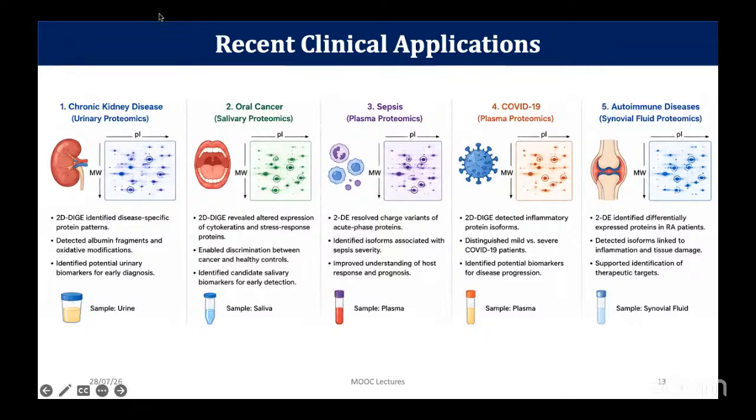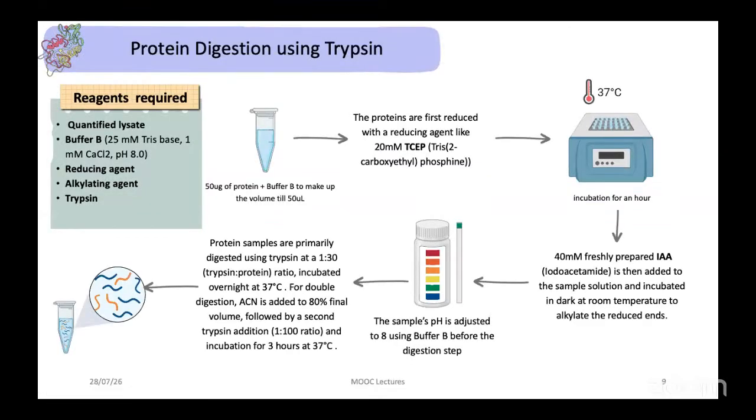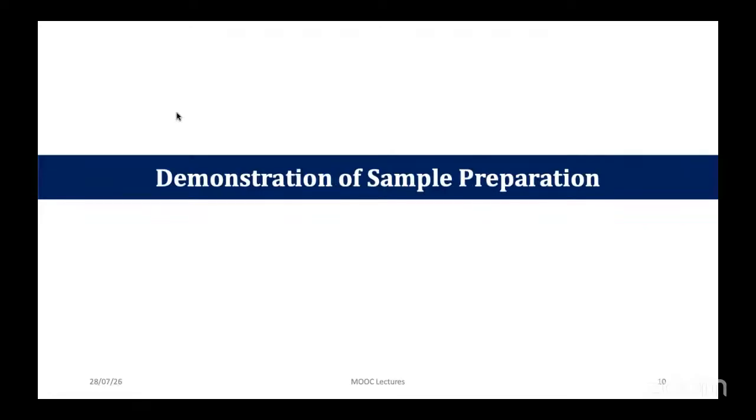Thank you, Prof. So I will just recap, where were we? I have just given you a brief, but in the successive live lectures, you will find how you can take this forward for the digestion of the protein samples. Once this is done, we have successfully completed the demonstration of the sample preparation.